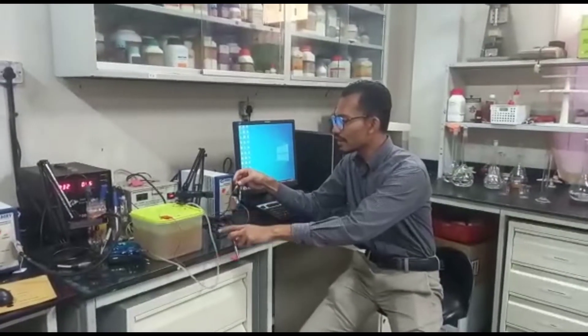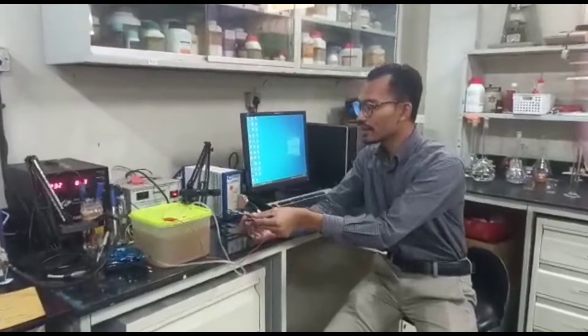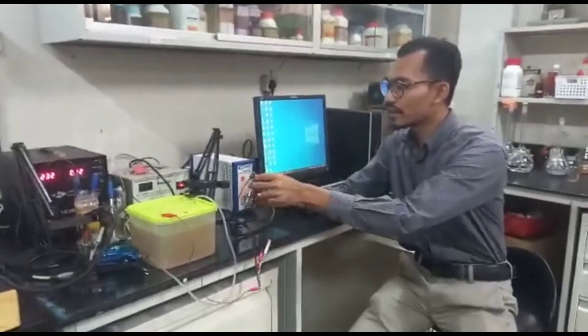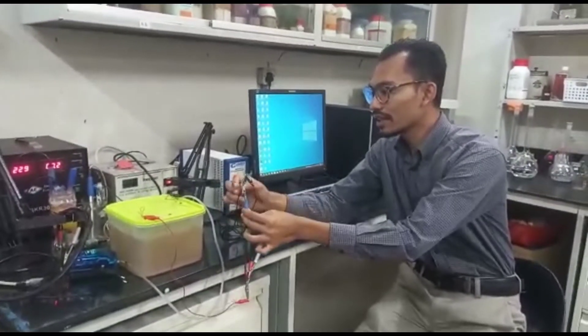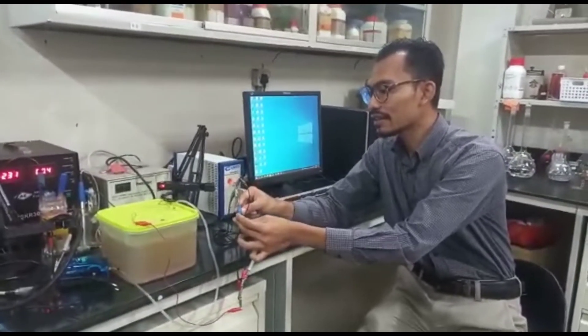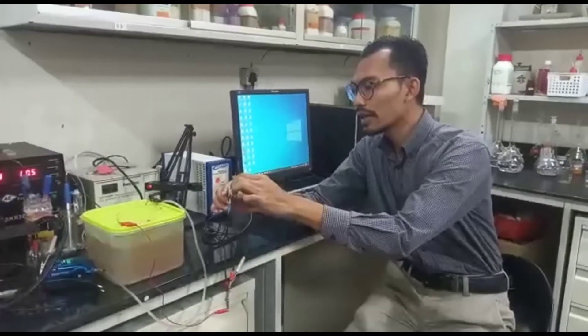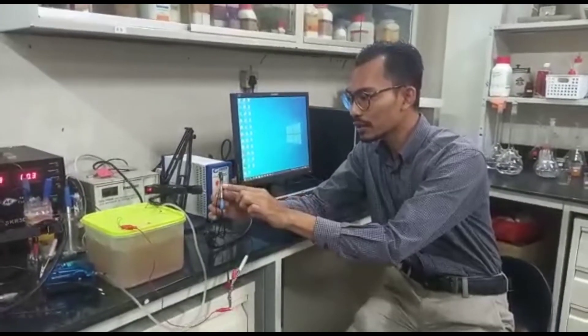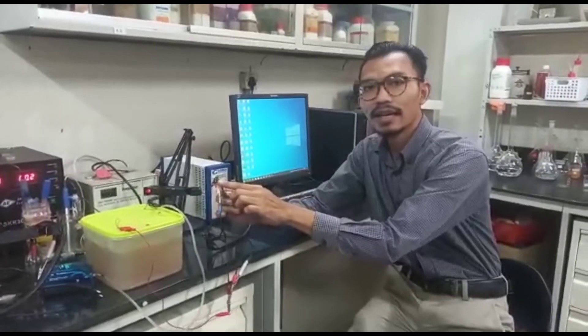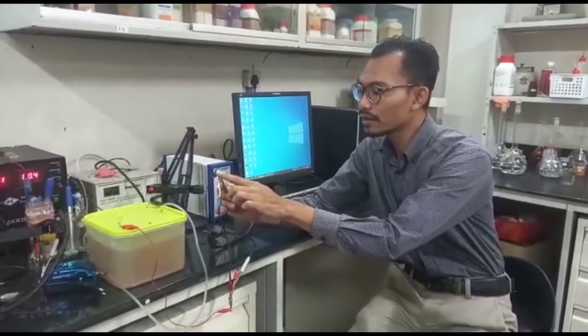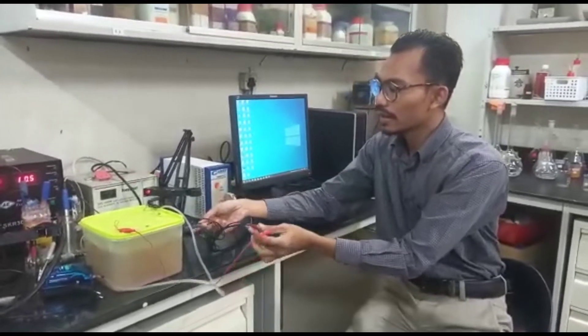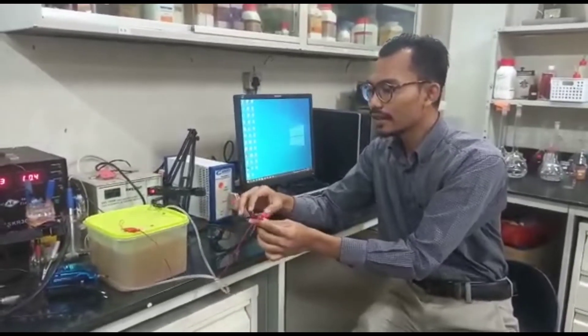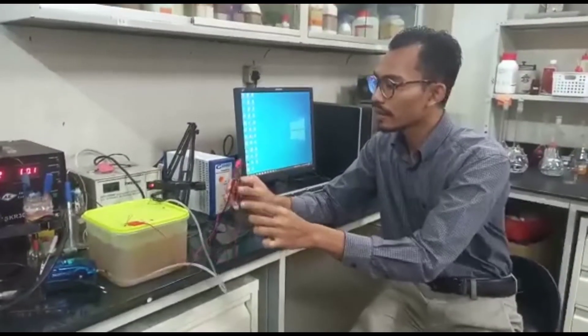So over here one of the terminals is actually connected with the working electrode. So the working electrode is green, working sense in blue color, so it will be short circuited together and it will be clipped together in one of your electrodes.